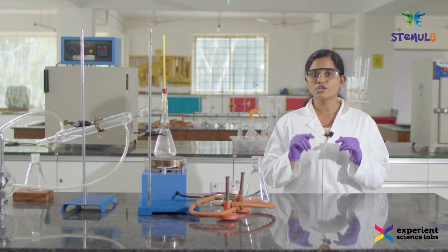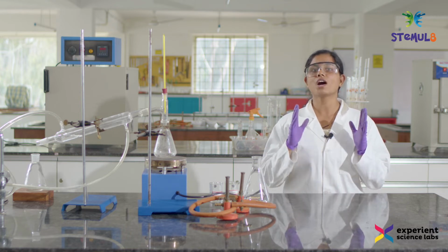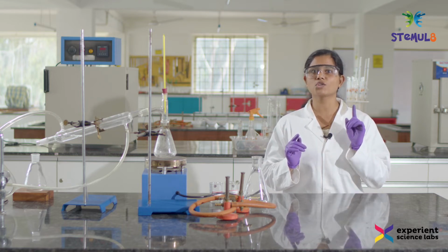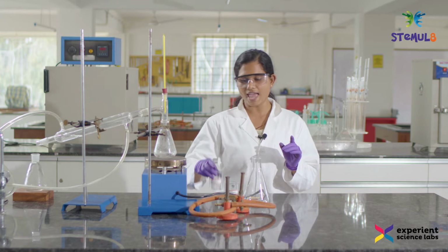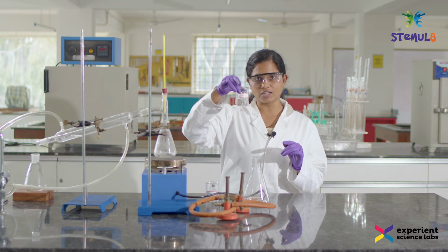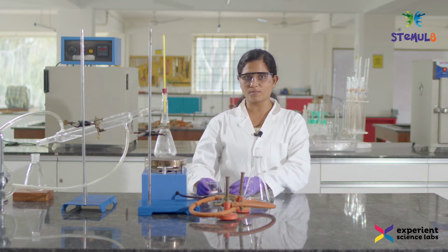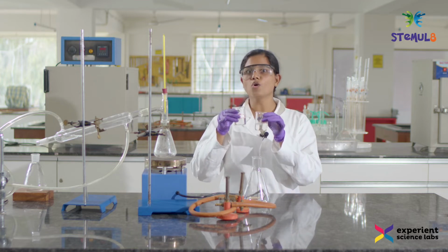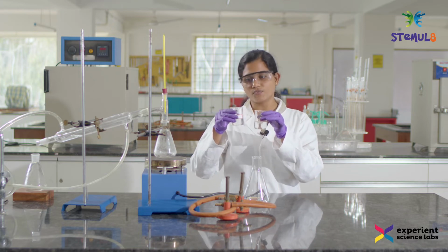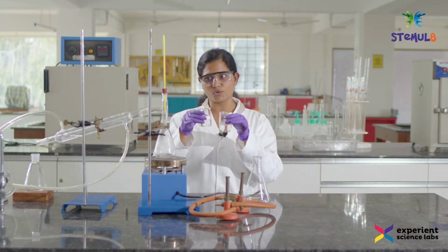a mixture. Today, the homogeneous mixture that I am going to consider is a mixture of water and ethanol. So water and ethanol will be taken in 1:1 ratio. So here I have 50 ml of water taken in the beaker, and this is ethanol, around 50 ml, in this beaker. So I'm going to mix both of them together and we are going to get a homogeneous mixture which just cannot be separated easily. So we are going to do it with the help of fractional distillation. So I'm going to mix both of them.